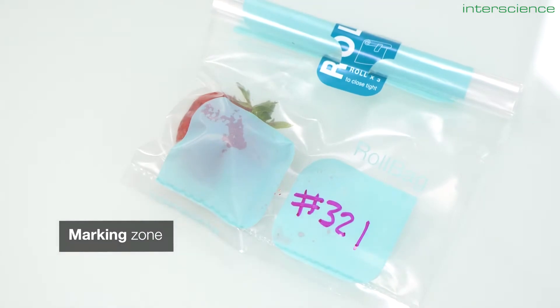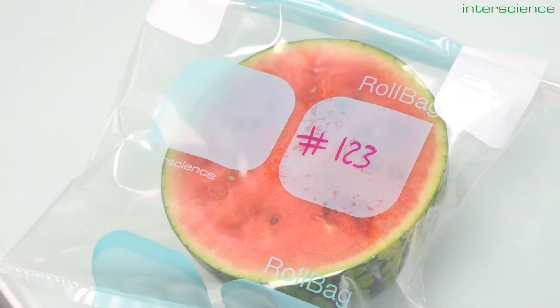We kept the marking zones to record the sample number and the date. Regarding water tightness — I'm serious, you should absolutely try this at home.